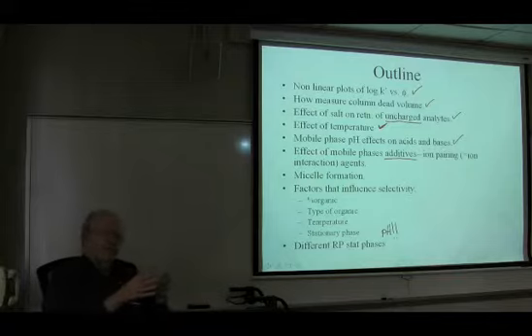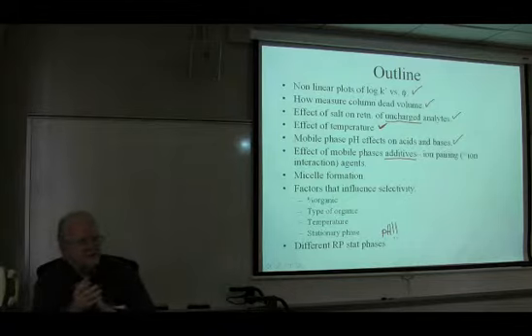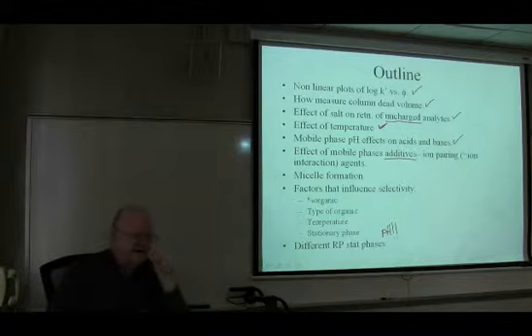The modifier is present in high concentration. An additive is probably present in millimolar, maybe 10, 20 millimolar concentration, and it will have a profound effect on certain solutes, not necessarily all solutes. So this is definitely a way to manipulate selectivity.